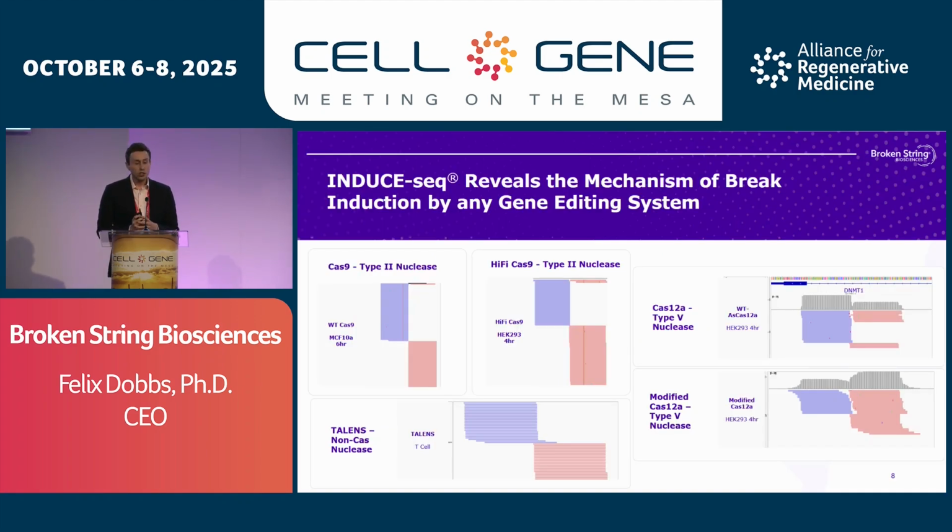So INDUCE-seq is actually, as I mentioned, a single nucleotide resolution readout where we can now reveal the mechanism of the break events directly. While going very broad genome-wide, we can zoom in right at the break site and get to the exact positioning of the nuclease cleavage sites.